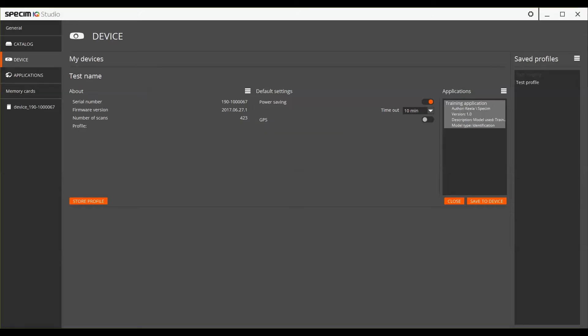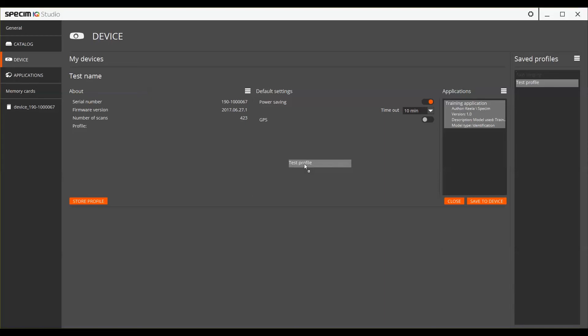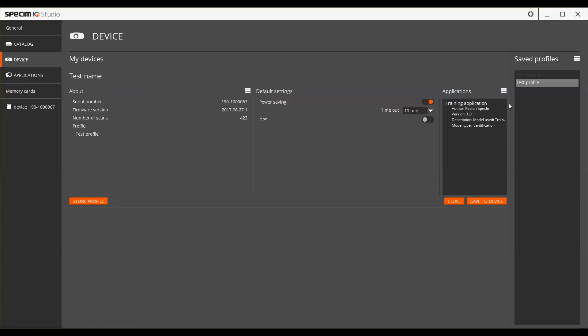The saved profile will then appear on the Saved Profiles list. To update the device profile, you can drag and drop the desired profile to the device. Remember that whenever you make changes to either the default settings of the device or update the applications list, make sure to press the Save to Device button.